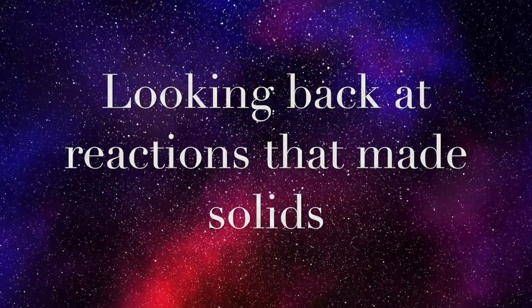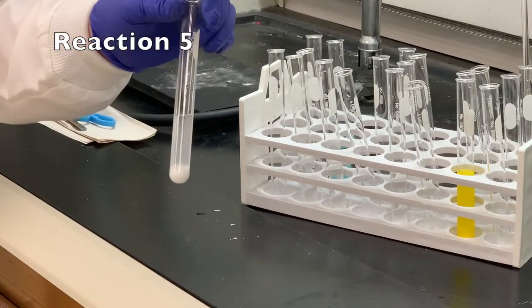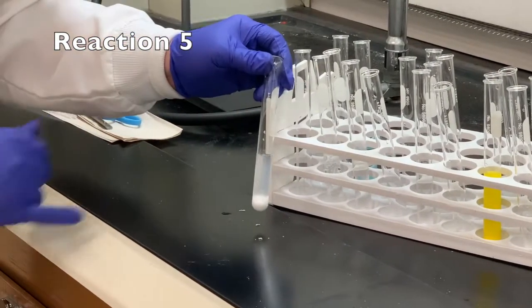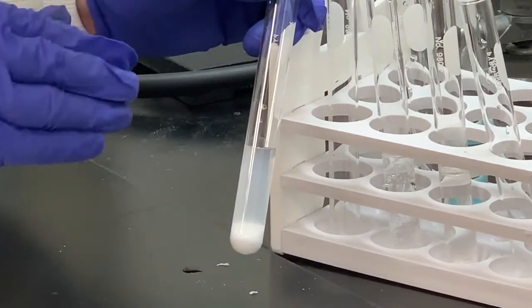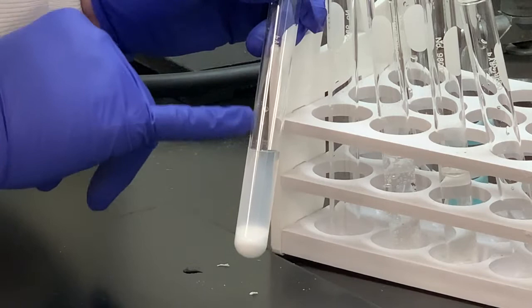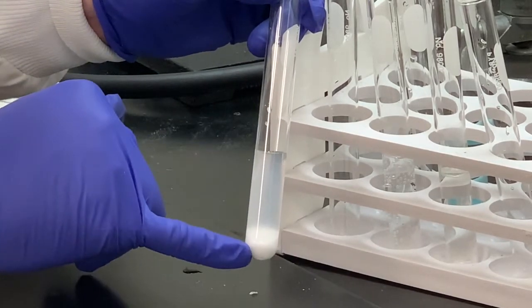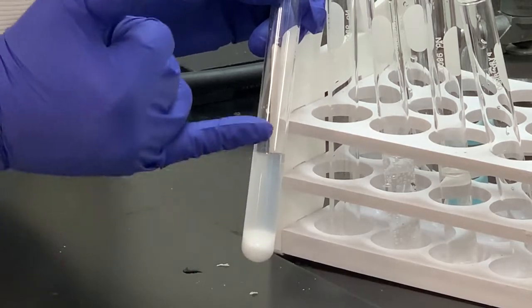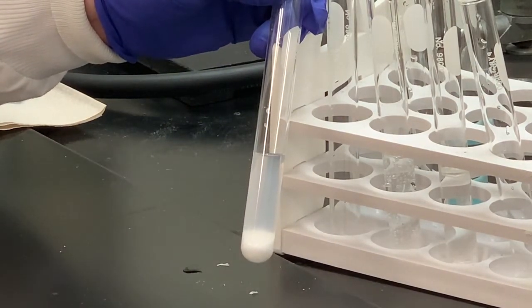I just want to go back to these others that formed the solid. I just want you to see, here's a good example. This was number 5, which was the sodium sulfate barium chloride. Do you see how it was all cloudy? We didn't really see a defined solid formation, but after it sat for a few minutes, notice by gravity, all that solid goes down to the bottom of the test tube. This liquid that's above it is that supernatant liquid that we were mentioning before.